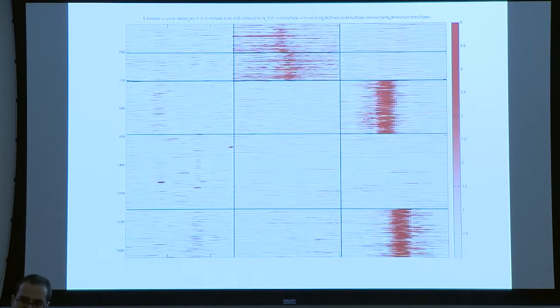Okay, so within each column, let's say we have three columns. The entire size of that is 5 kb. Exactly. And then across chromosome 19, you're seeing different regions. From the top to bottom, it just numbers how many regions you have, so it goes up to 1,650. But theoretically, base pair 0 would be somewhere. This depends how you organize it.